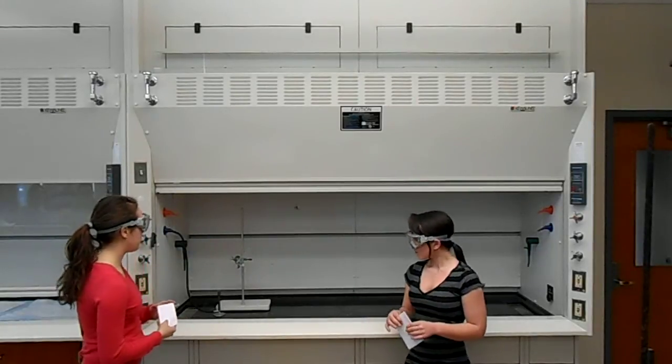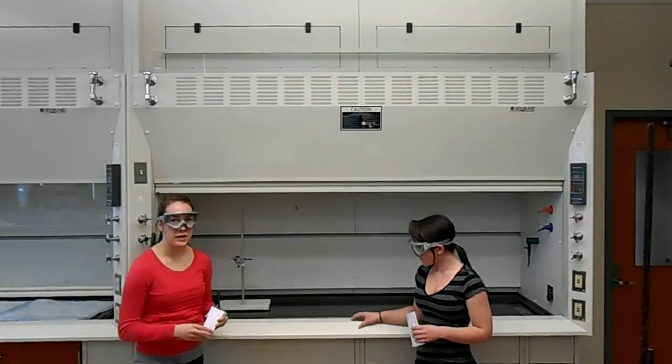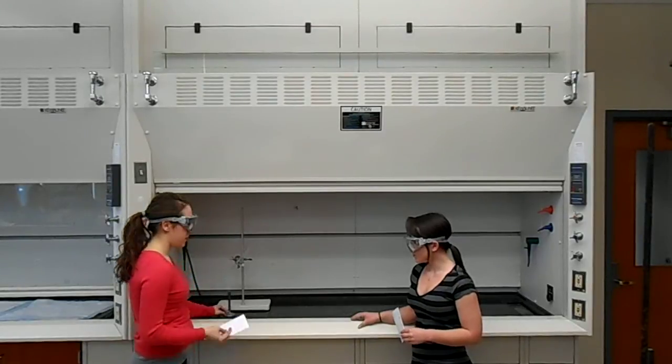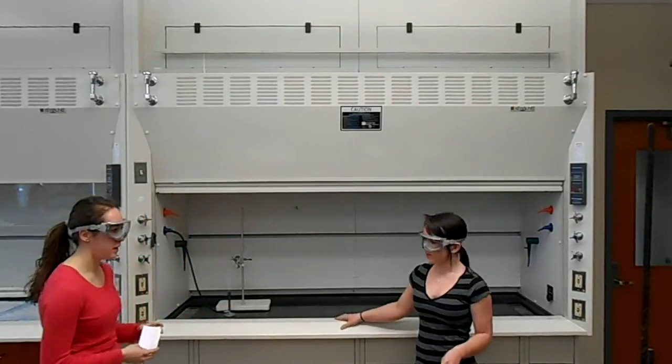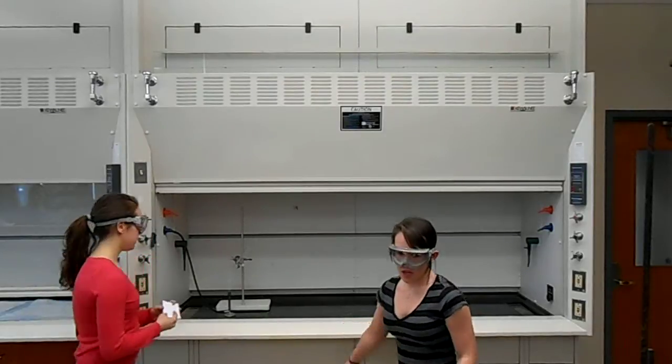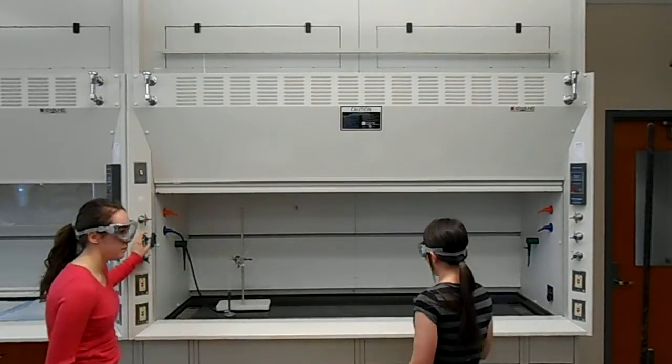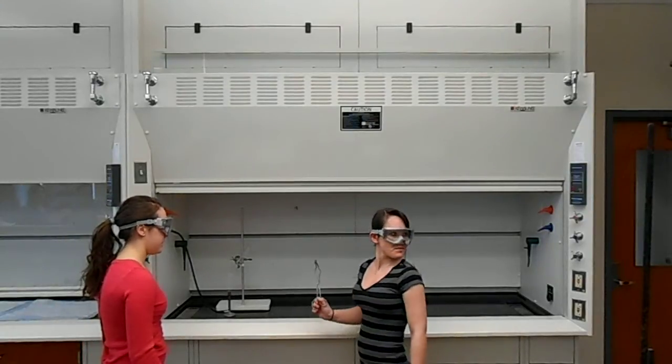As you can already see, we melted the potassium chlorate with the Bunsen burner, which we already did. So what we're going to do now is drop in the gummy bear. You must make sure that the hood is completely closed after you drop the gummy bear in, and turn the gas off as well.